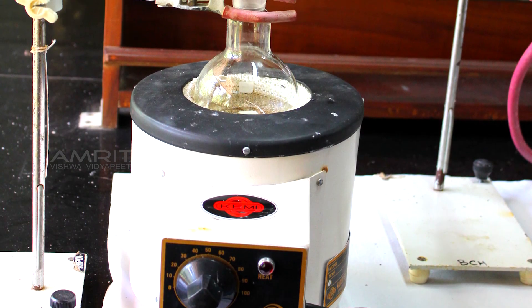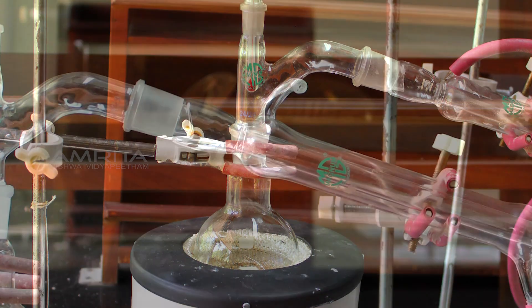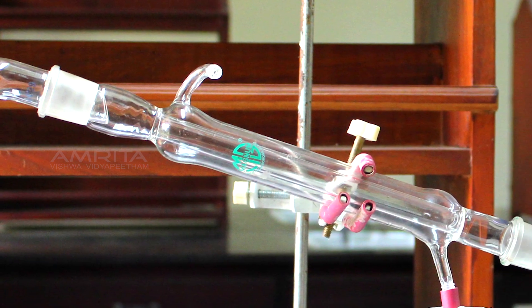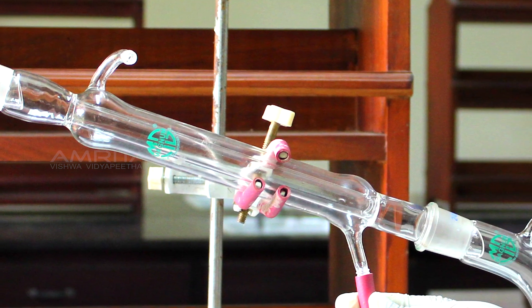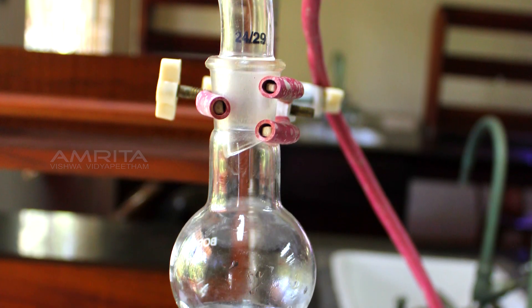The distillation process involves heating a liquid to its boiling point and transferring the vapors into the cold portion of the apparatus, then condensing the vapors and collecting the condensed liquid in a container.